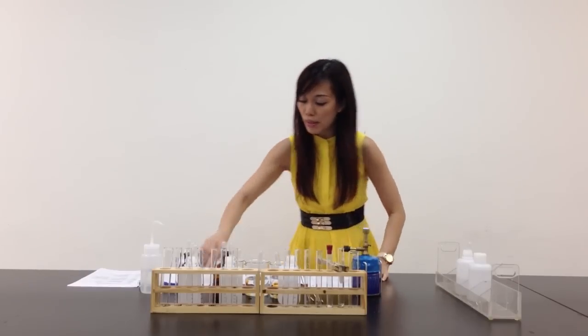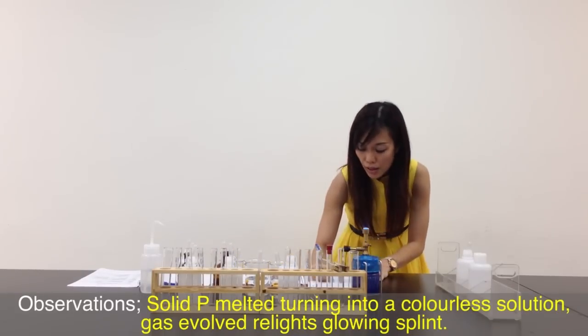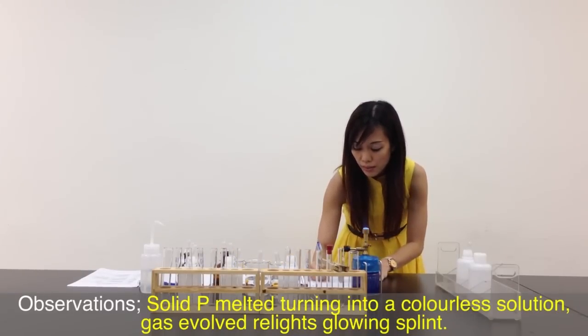The gas evolved actually relights the glowing splint. I've finished my first step. Let me quickly write down my observation: solid P melted and becomes a colourless solution. Gas evolved relights the glowing splint.